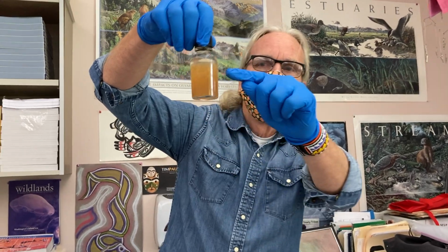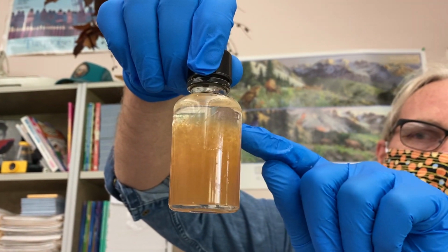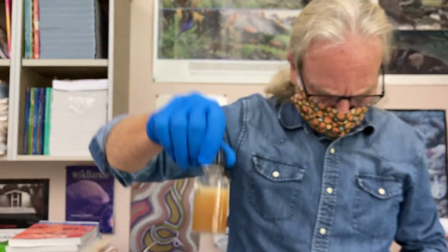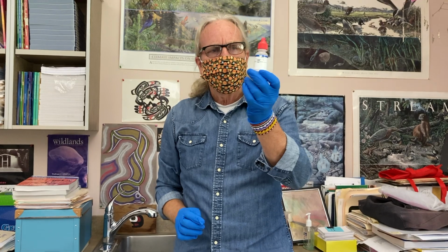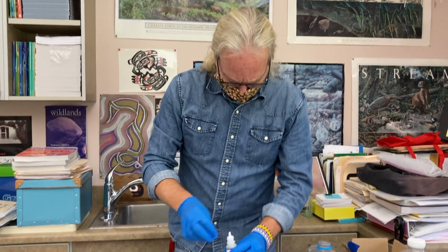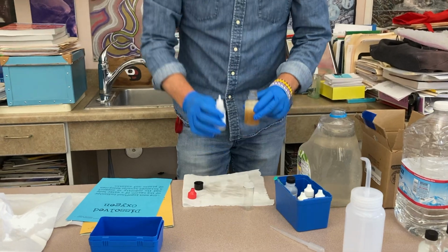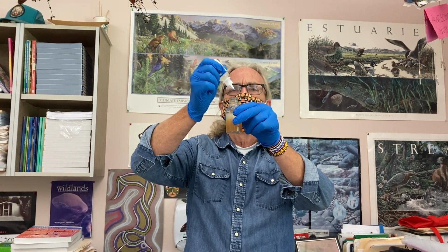As you can see, the flocculant has settled. You can see clear up here at the top from the shoulder of the bottle upwards. And now it's ready for the next chemical, which is the red cap. That means it's highly toxic. It's sulfuric acid, diluted but still toxic. And again, it's 8 drops. That's the good thing about this. You don't have to remember anything but 8.